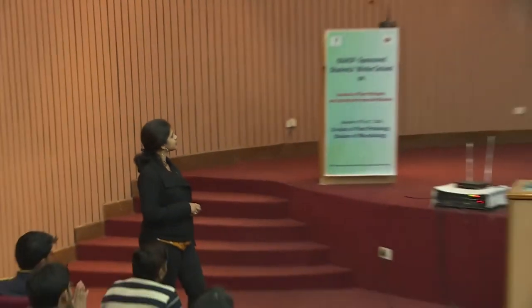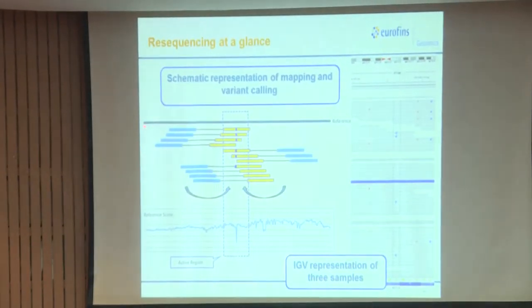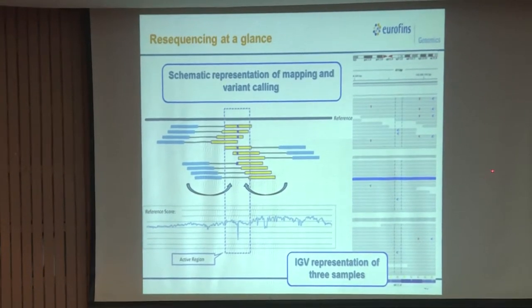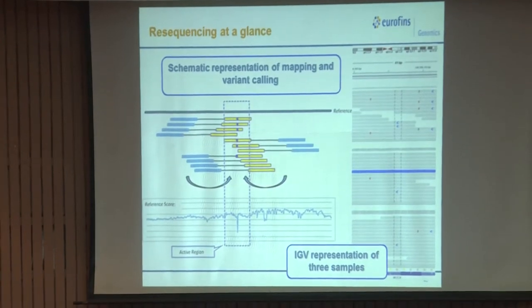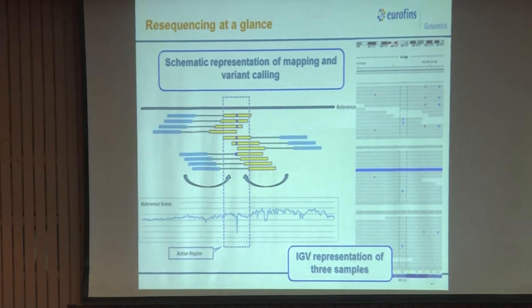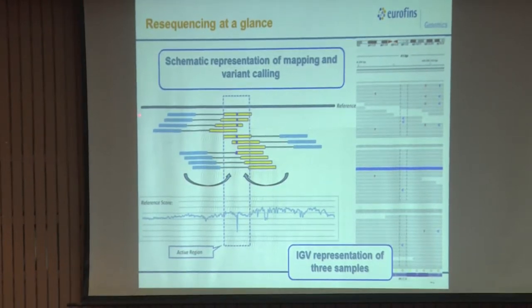So we identify SNPs based on the differences in the sequences. Once we map the reads, what we identify is, from this end to this end of my reference, how much percentage I am covering. That is my genome coverage. Earlier, we were seeing how much is my genome assembly, how much is the percentage of genome content in it, ATGC. That is the size of the genome. In this, if my size of genome is 50 MB, right, we see how much I am able to cover after mapping.